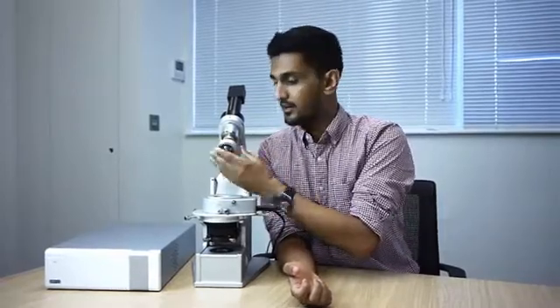Just be aware that you will need to use reflected light on this setup. We've got a reflected light collar over here that we can provide with the system.